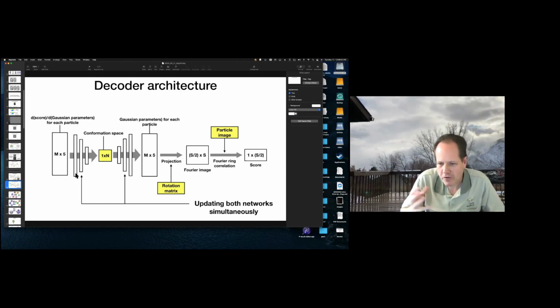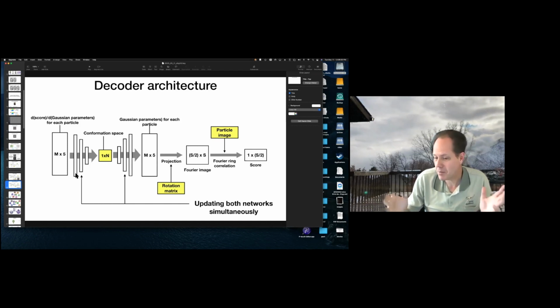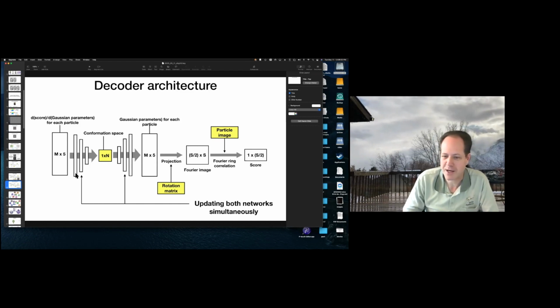Yeah. So for small particles, you could actually begin to do that now. For small, like less than 100 kD, you could actually generate enough Gaussians, and the particles themselves are small enough that you actually can fit it into the GPU memory. But with the scaling being n cubed, it gets bad pretty quickly. So if we're 5 years down the road, then maybe we'll have mega GPUs with a terabyte of memory, which can handle that sort of thing easily. But there are definitely limits now.